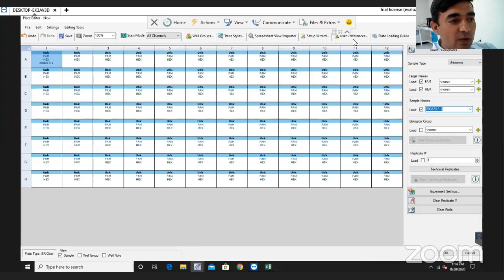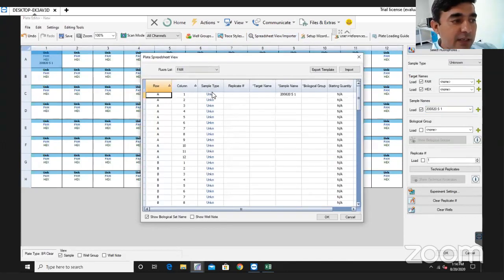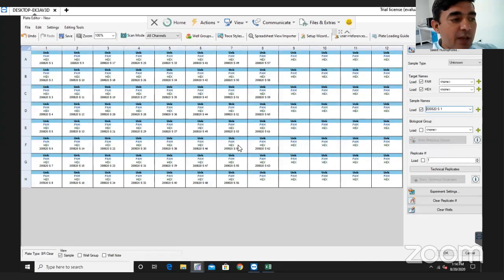After copying these, here they give us the option to import a spreadsheet. If we look at importing the spreadsheet, from the column row we select the sample. Currently it's selected like 1, 1, 1, 2, 3, numerical numbers going up chronologically. We select all the columns together, like each column of a PCR plate. Once the column is selected, in the sample name we can just paste our name and we select OK, and you can see that these samples are appearing over here.